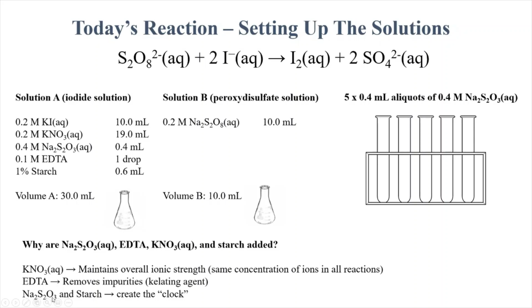Now, the sodium thiosulfate and the starch are how we're going to create the clock. We need not only our reactants in this case, but we need some way of measuring how quickly the concentration of these reactants is changing in time.